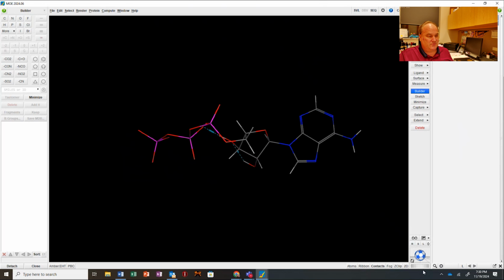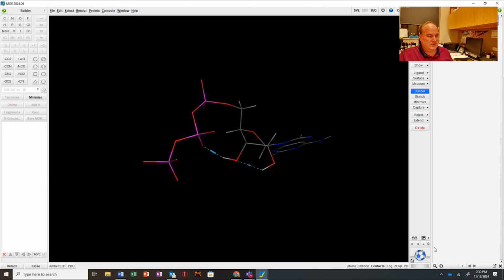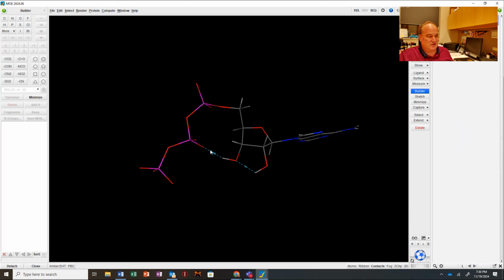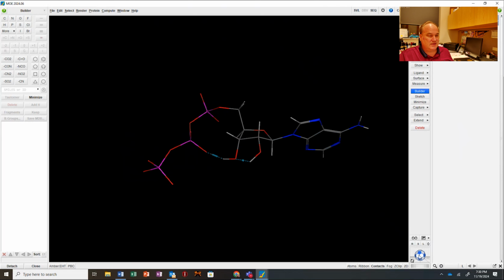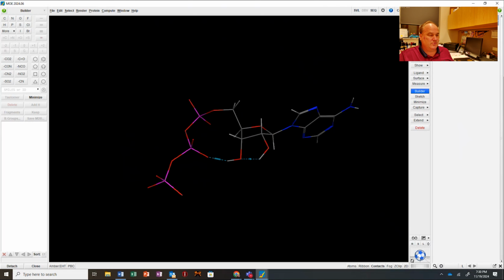And so as soon as I perform that energy minimization, you notice I formed an internal hydrogen bond. Of course, I did not have the magnesiums that are usually complexed with ATP in this case, but that's no big deal there. So the protonation state, what you do want to consider, especially if you're at physiological pH, you do want to consider that protonation state when you're importing from databases, because that's a very important step, right?